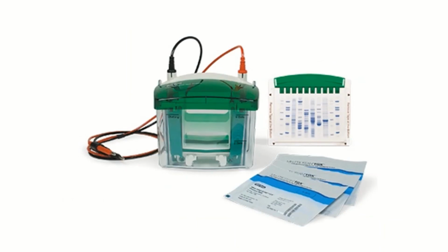And this is our equipment, this is our tank, and this is our gel. So here it is in the package before it's opened. It's stored in the refrigerator. And here it is after the gel electrophoresis is over.